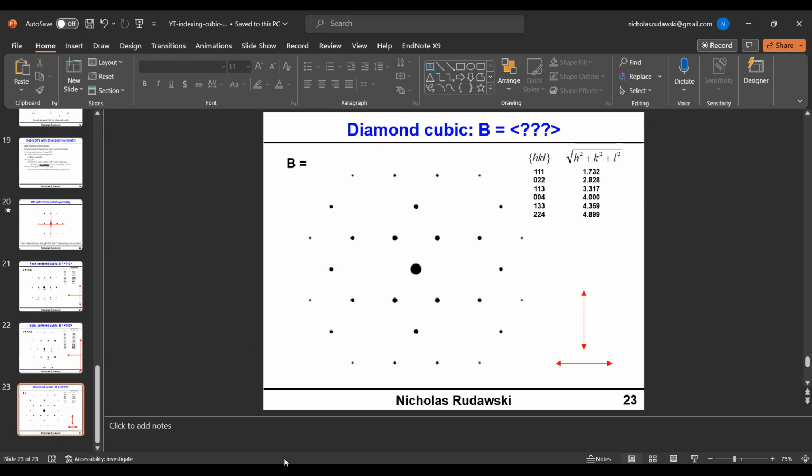All right, so you can see some interesting things. First of all, there's actually some holes here. Inside these rings, there are some spots missing, which is kind of odd. You would think, based on the arrangement, you'd probably see a spot here and here, but we don't. There's actually a good reason for that, which we'll get into in a minute. The other thing is, it might be tempting, if we had a spot here, to think that this was 6 mm symmetry, but it's not. You have to measure carefully to verify that, but you could actually show that you don't have that symmetry, and this is 2 mm symmetry.